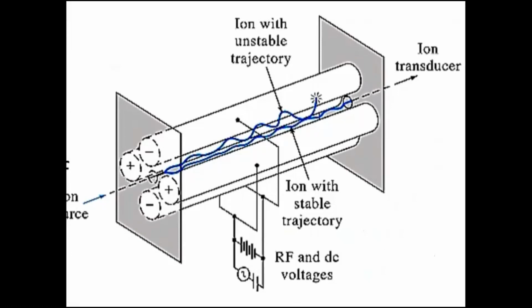There is an arrangement such that the voltage between the rods will change alternatively, and the frequency with which it is changing is radio frequency.